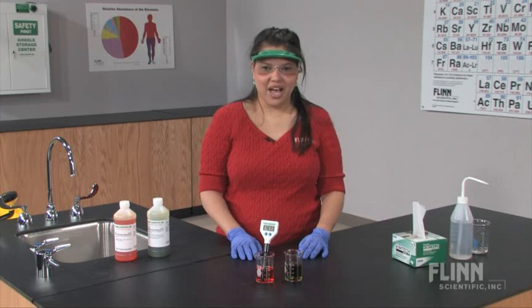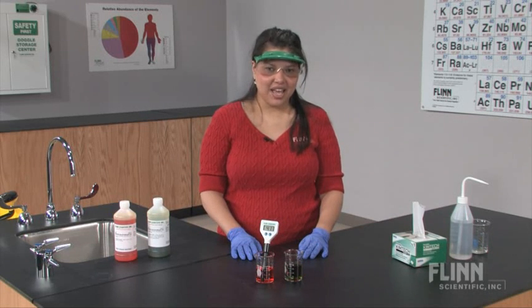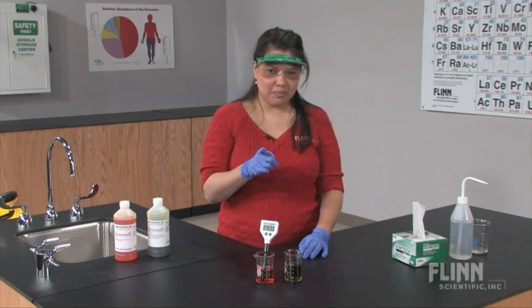Quality, value, and service. That's why it's called the Flynn pH meter.